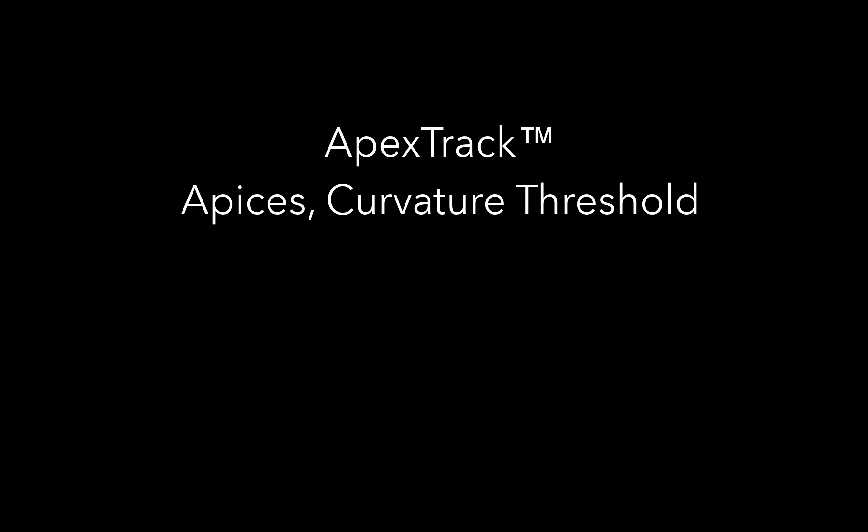This video is part of a series about a peak detection algorithm called ApexTrack. Here we'll discuss how ApexTrack starts detecting peaks, as well as one of its most important configuration options called curvature threshold.